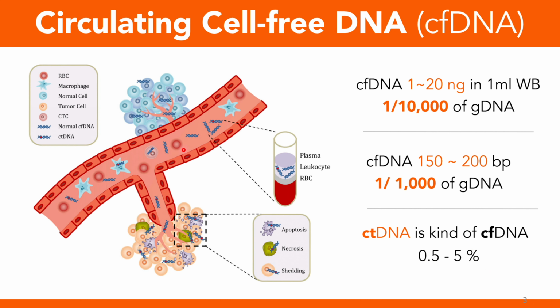Before, people thought this kind of circulating cell-free DNA was actually a kind of recycling of the DNA. But recently, as detection sensitivity is higher, NGS and digital PCR are more popular, and there are more DNA-based biomarkers. Now we know if we can capture those circulating cell-free DNA, then we can detect if there are any cancer cells inside of our body to do cancer early detection or monitoring.